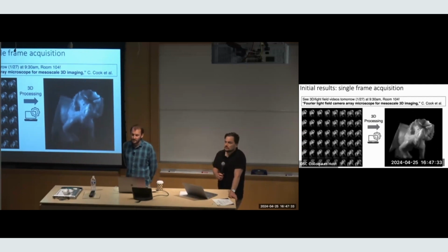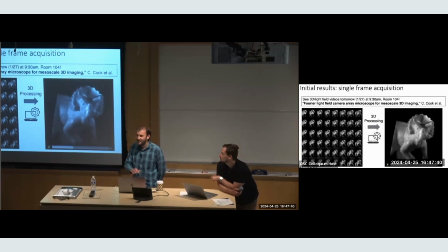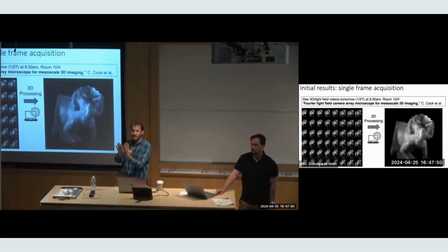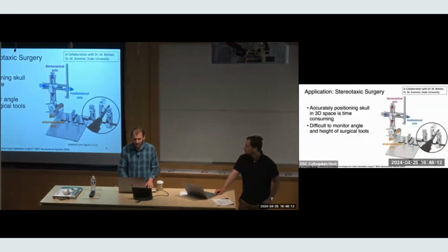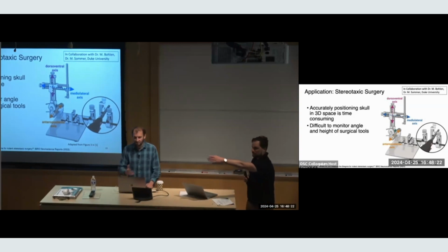Yeah, that's a good point. Sorry, I didn't know it moved. Unless you really want to be hypnotized. If you're familiar with light fields, that's essentially what we're capturing. So we can do what's called digital refocusing, and when you do that, you can play games like pulling out specular versus non-specular reflections. I maybe have a slide, but let me just see. It's a little more nuanced of an approach. I don't have a slide, but we can talk about it later. It's not so simple.